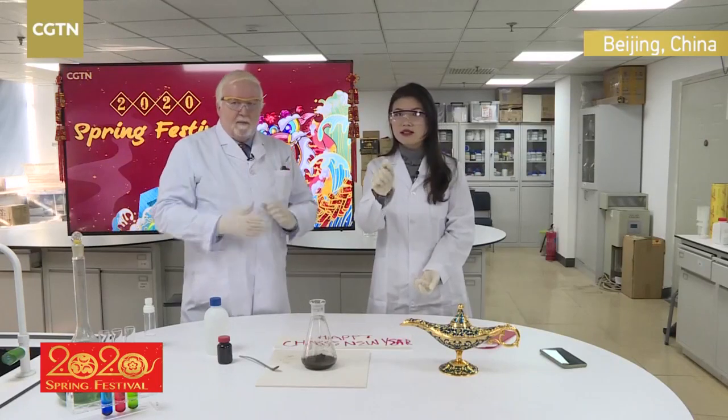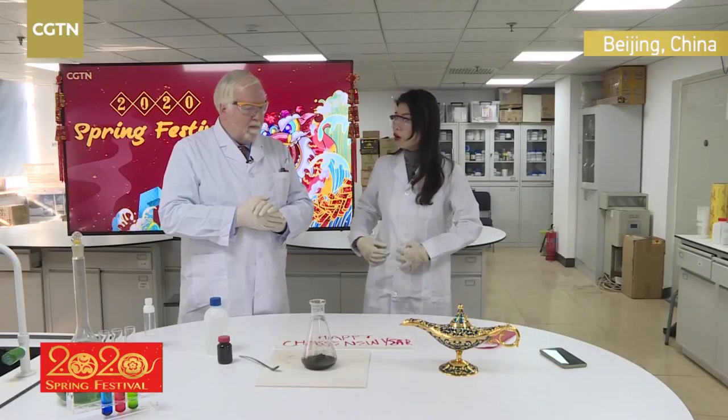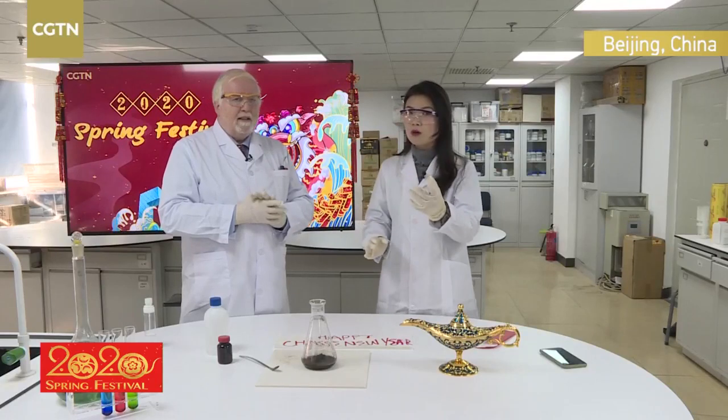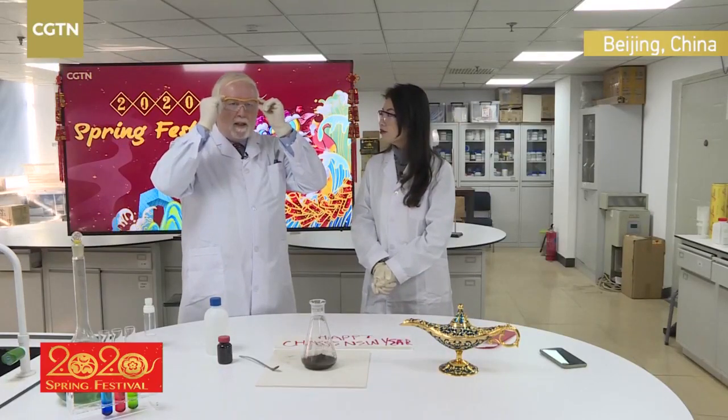So make sure, guys, safety first, because we are here in a chemical lab, so we have our coat on, our goggles on, and also our glasses on. If you follow us at home, make sure to have all the safety preparations, especially the goggles. Every time you do an experiment, you should have the goggles. If you look at any of my videos online, you will see I'm always wearing these very characteristic goggles with the yellow frame. So hopefully it stands out and reminds people, Dr. Dai is wearing his goggles, so if I do an experiment, I should be like Dr. Dai and wear goggles as well.